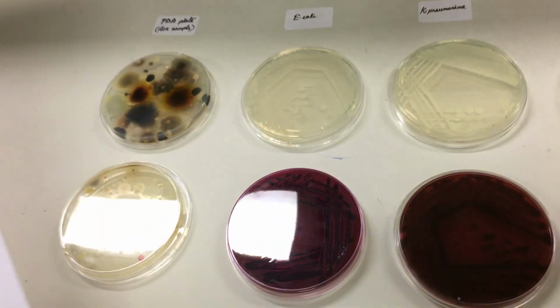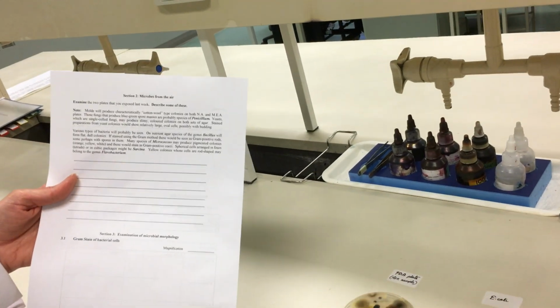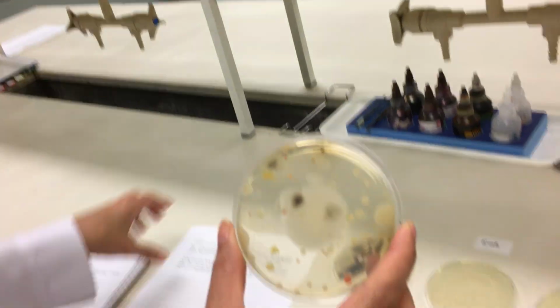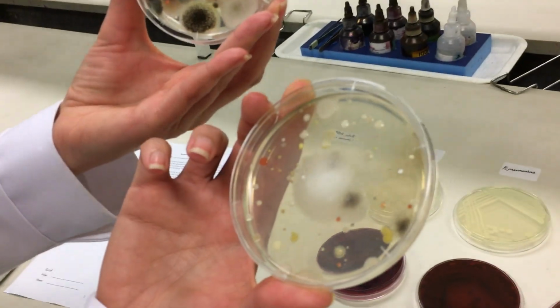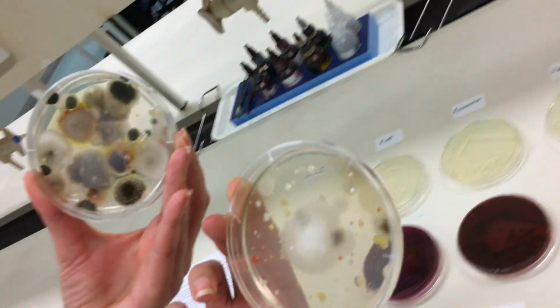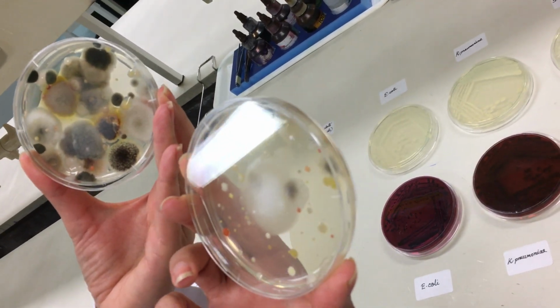For the last section, we are going to provide you some additional information, but you have this observation. You can see, I cannot open the plates. You can see this was located in front of the entrance of the lab.